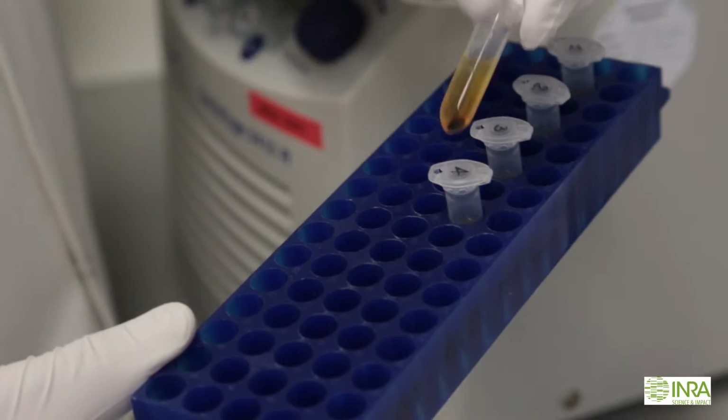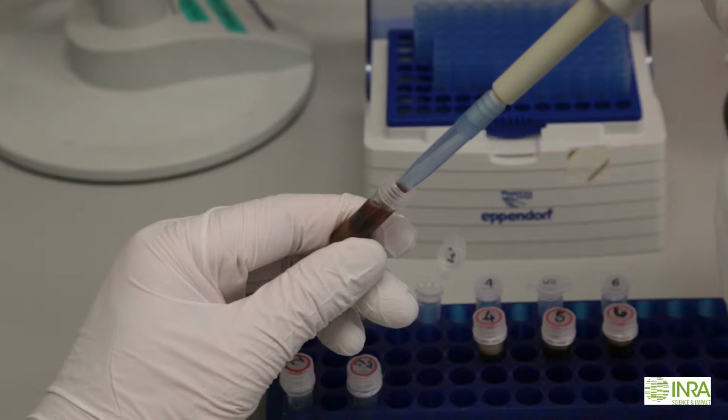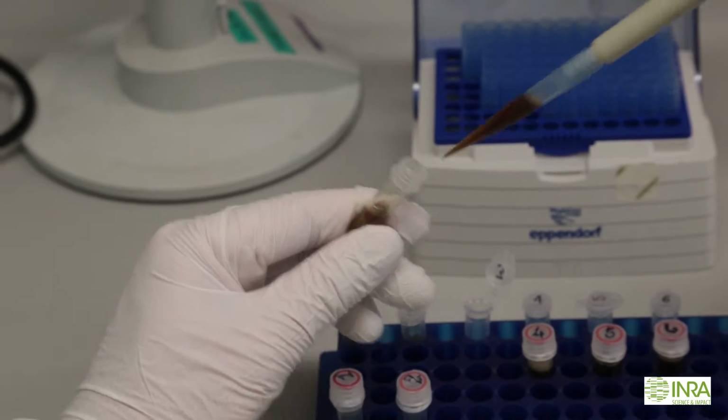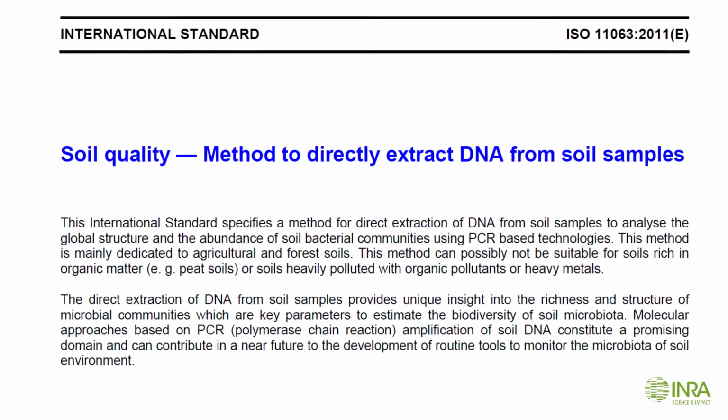We are doing so because we developed a new method to extract DNA from soil 10 years ago, and we worked at ISO level, the International Standard Organization, to transform this method into an international standard, the International Standard 11063.